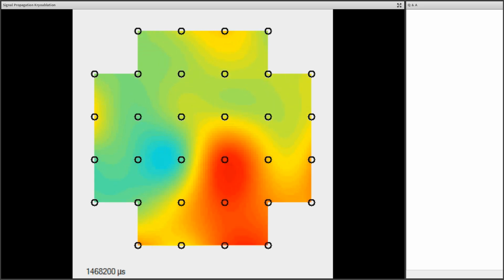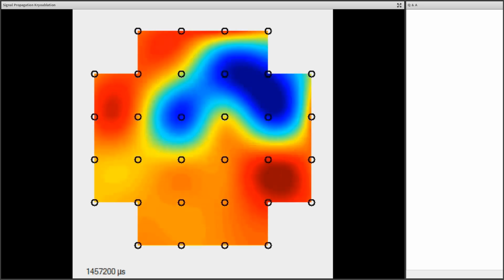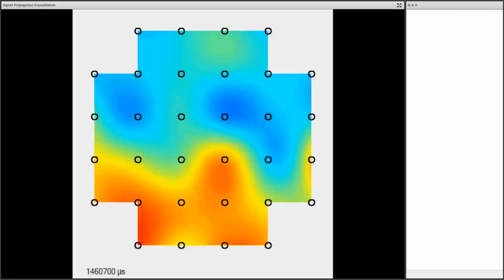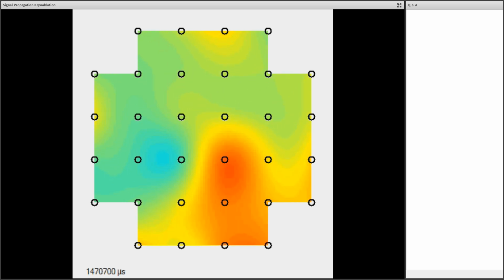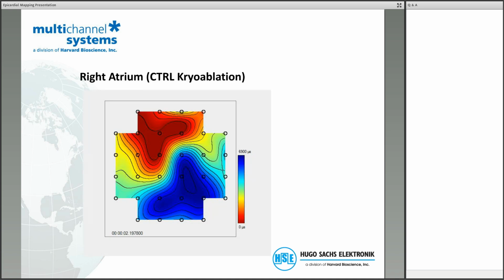And if you know a little bit about the generation of cardiac arrhythmia, these re-entry cycling excitations in certain parts of the heart are usually one of the mechanisms by which you can trigger especially something like atrial fibrillation. And you see, I think in this movie very nicely, by destroying the conductivity of parts of the tissue, we can trigger a kind of early indicator of this form of arrhythmia.